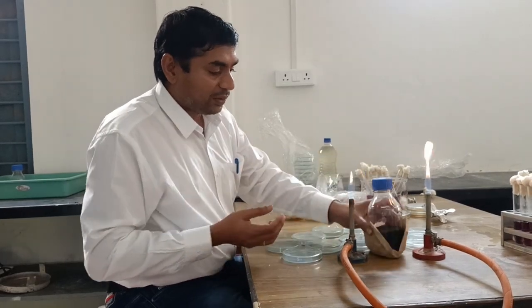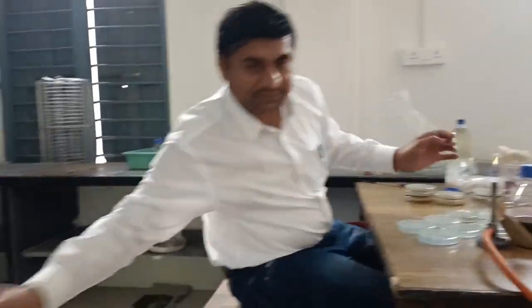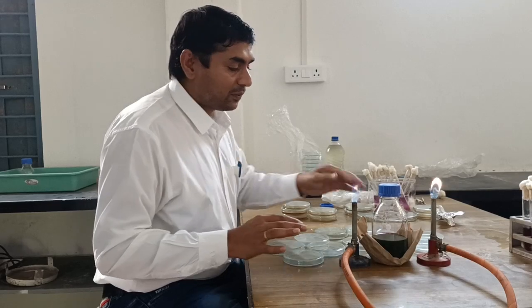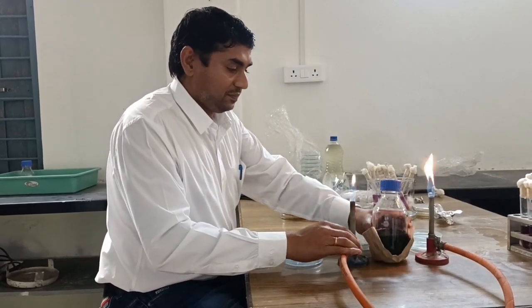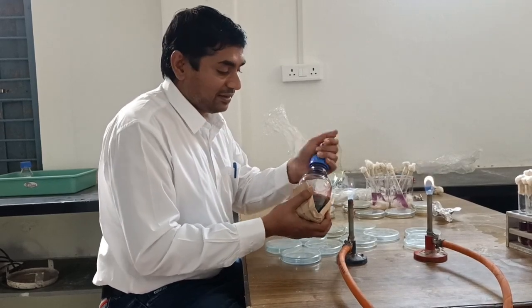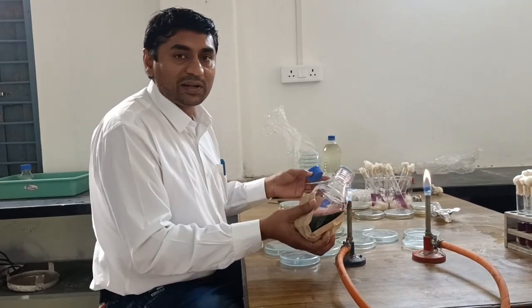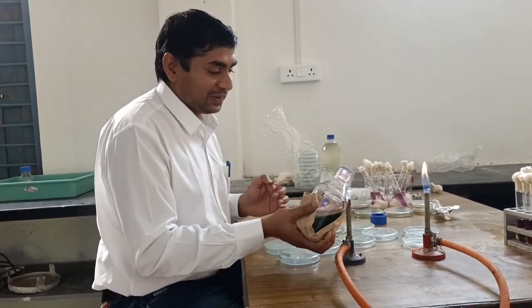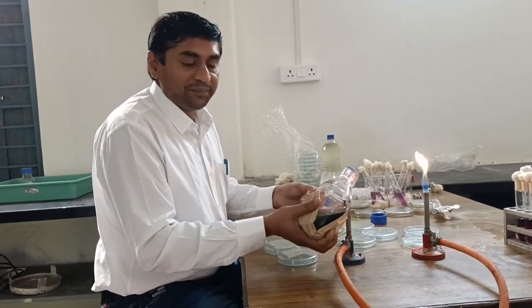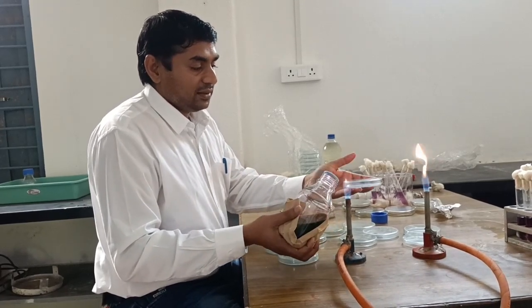All operations should be performed in front of flame. We can use disinfectant, that is 70% ethanol. The bottle contains EMB agar, or eosine methylene blue agar. Open the cap of the bottle, or if it is packed with cotton then remove the cotton plug, then flame the mouth of the bottle or flask.